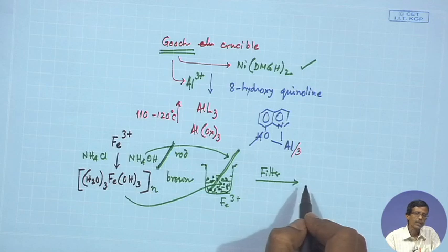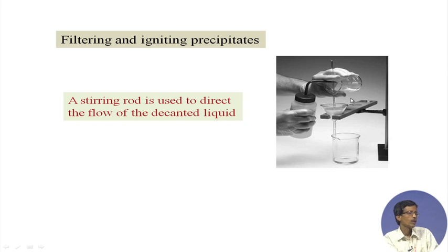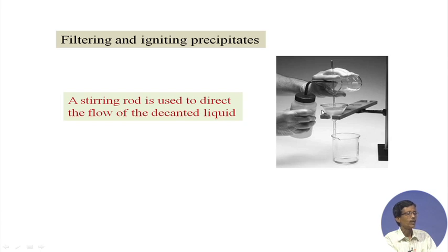Initially the whole bulk is transferred over the funnel fitted with the filter paper — we will also see how to fold the filter paper. The glass rod used for transferring the reagent is also used here. At the end, when most of the bulk of the ferric hydroxide solid has been transferred, you have to wash and clean the beaker to quantitatively transfer the entire precipitate onto the filter paper.